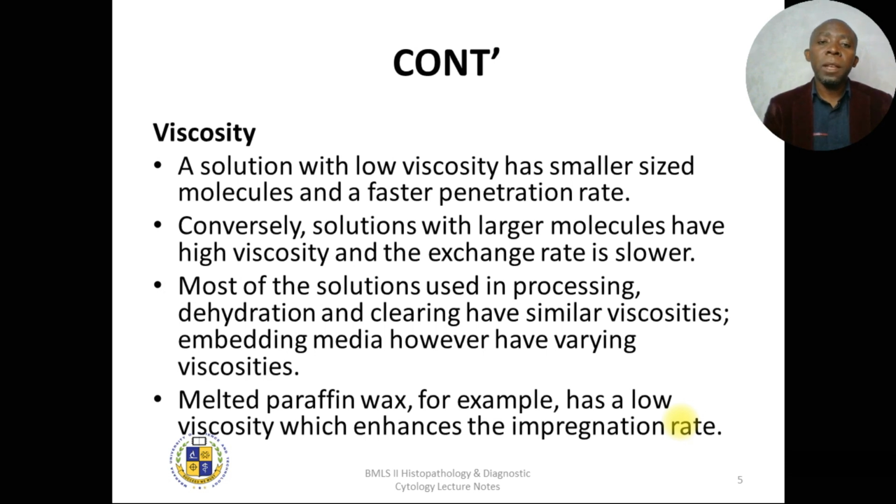Most solutions used in processing, dehydrating and clearing, we prefer those with similar and smaller viscosities, even those used in embedding media. However, they have various viscosities depending on when we want to use them. For example, the viscosity of the embedding media may not be the same.